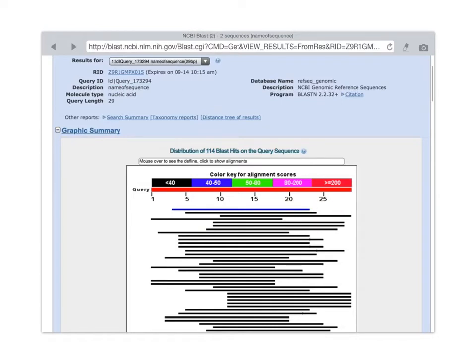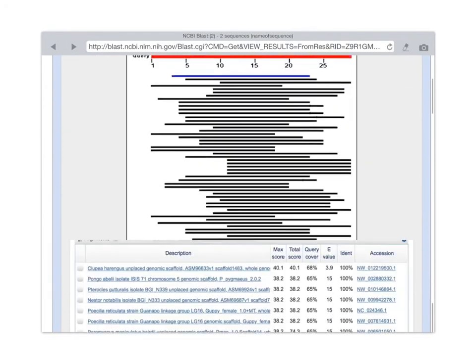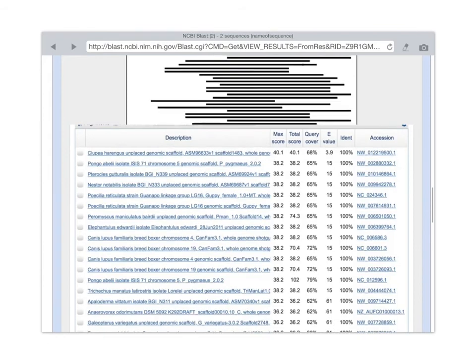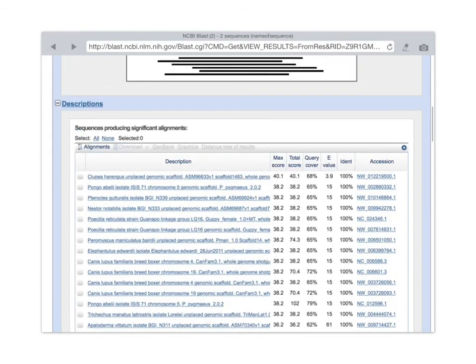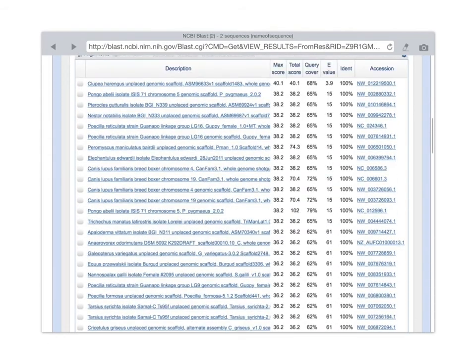Because we're using such a short search sequence, none of the scores are going to be very large. And if we scroll down a little bit farther, we have a table view of the same information, essentially, telling us, for example, the name of a species.